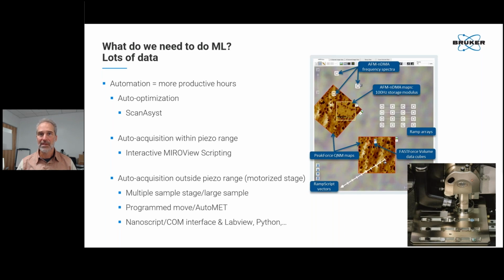Also, we have Nanoscript and COM interface, which allow you to run the stage and acquisition system from LabVIEW and Python, that kind of thing. So let's talk a little bit more about that.